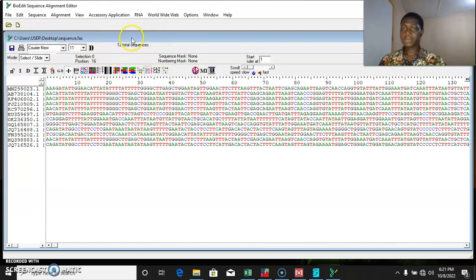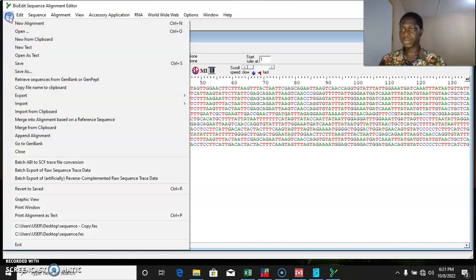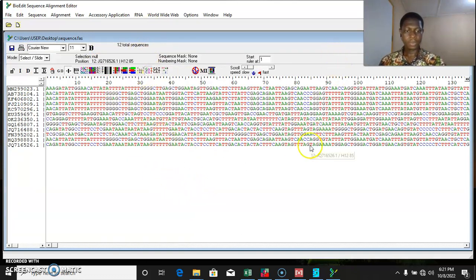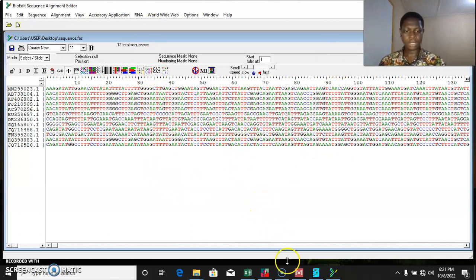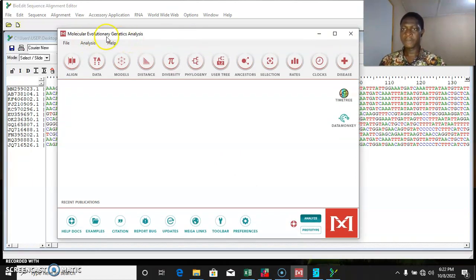In order to add more sequences, provided you needed to add more, you simply need to copy your sequence from the source and then import it here. But for this example we are simply going to be using 12 sequences. The next thing we want to do is run a multiple sequence alignment. We are going to be using the Molecular Evolutionary Genetic Analysis software — more like the MEGA software.